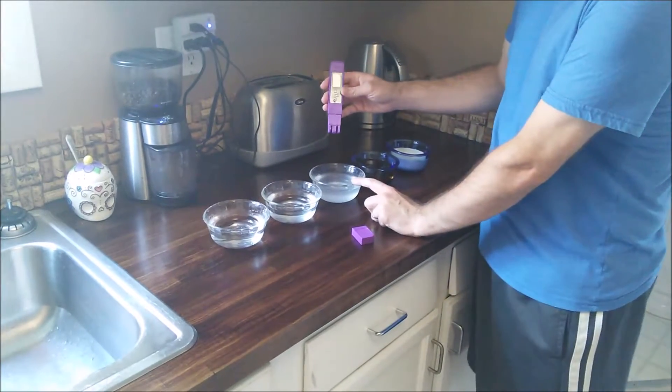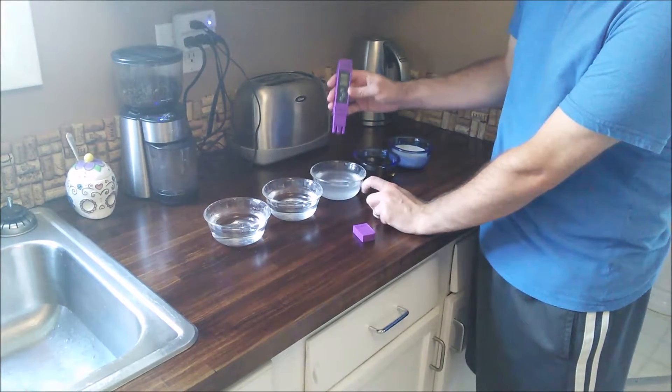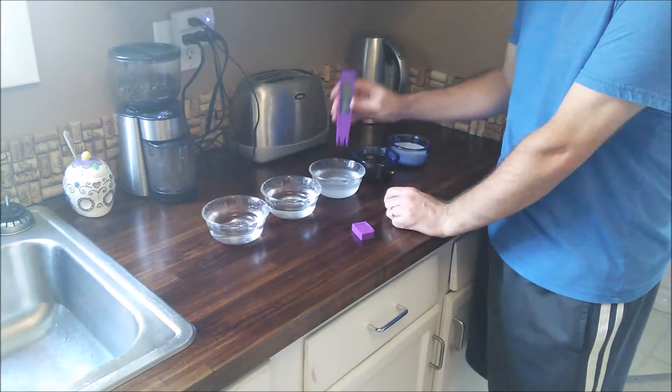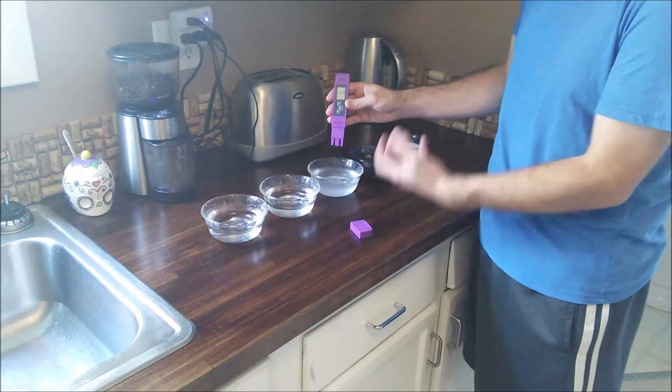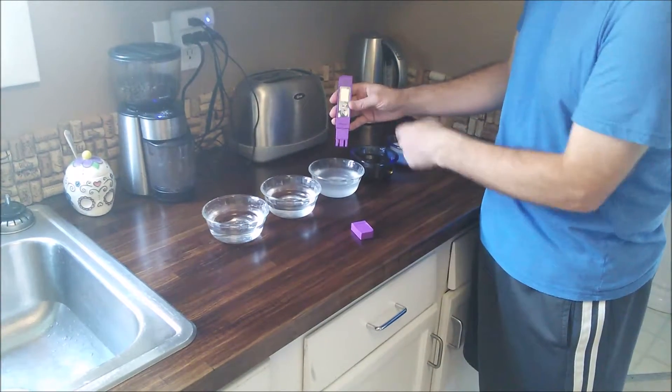Next I have some salt water and this should have a pretty high reading on it. It can't even read the salt water — it is just too many particles in there and you get an error reading on it.